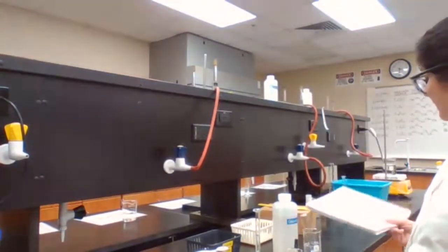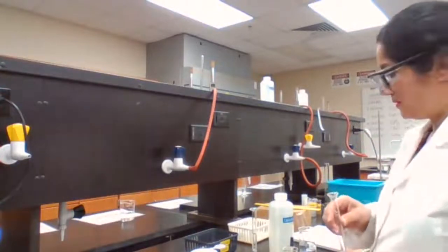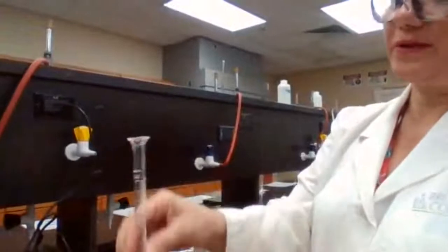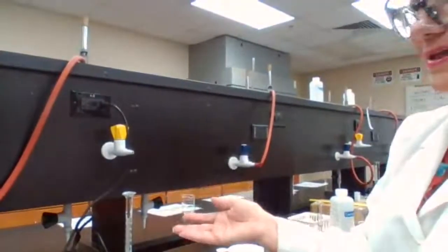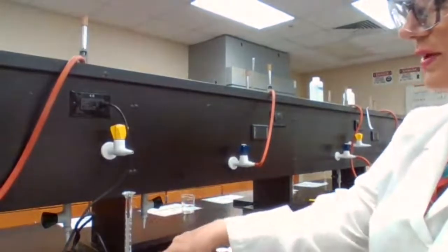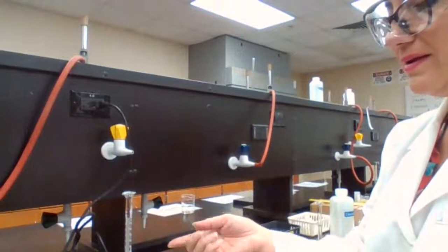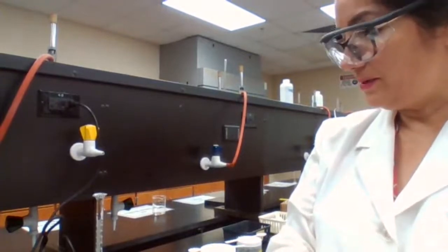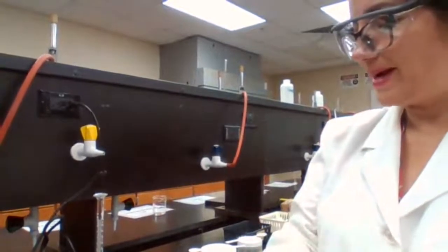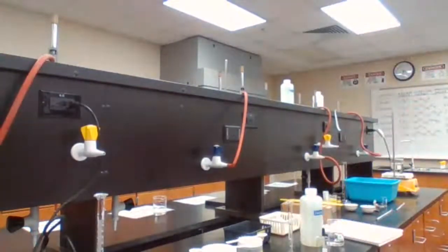You also want to find the density for water. To find density for water, we take 10 milliliters of water. We're going to get the mass of the graduated cylinder. Because in order to find density for water, we need the mass for water and we need the volume for water. To get the mass for water, now you practiced already, you have to measure the mass. How do you measure the mass for water? You have to have an empty container. You measure the mass of the empty container. And then you measure the volume. So you add the 10 milliliter. Then you measure the mass again. That would be the mass of the container plus the mass of water. Let me record this number so I could put the number in one step for you. Get a pen to record that.